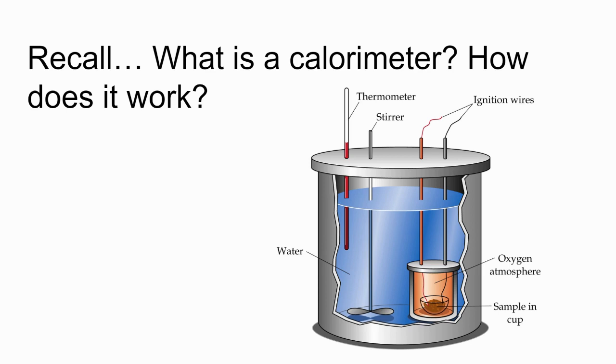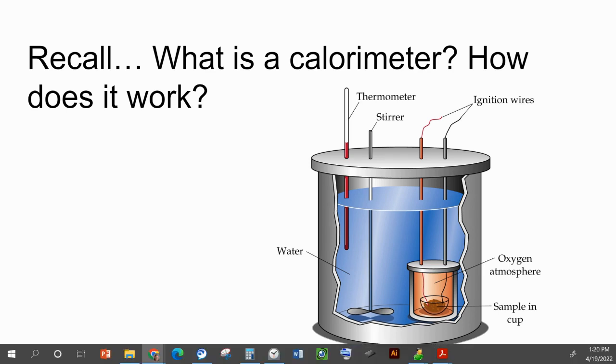And then this is going to be our water container. So this one doesn't have a hole. You're going to fill this about a third with water. The amount doesn't matter too much. If you fill it too full, then the scales we're using aren't sensitive enough. It'll say error. If you get that error, just dump some of the water out. Okay, so about a third shouldn't make the scale angry.